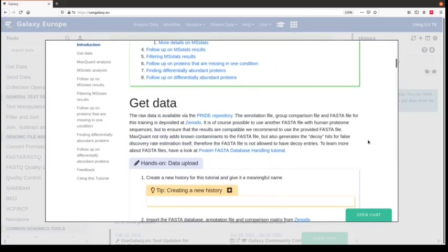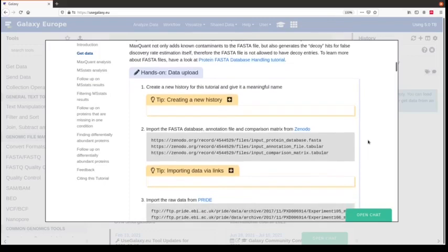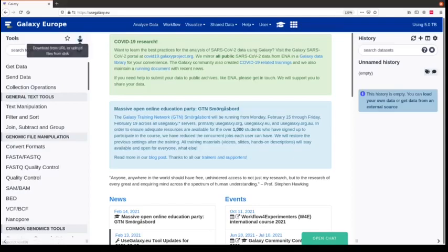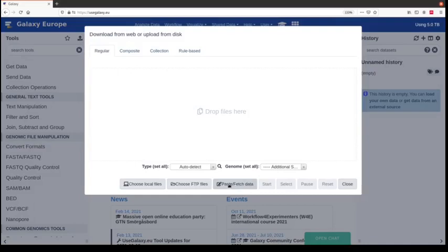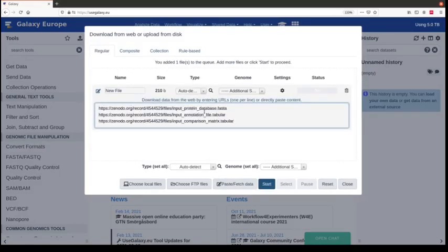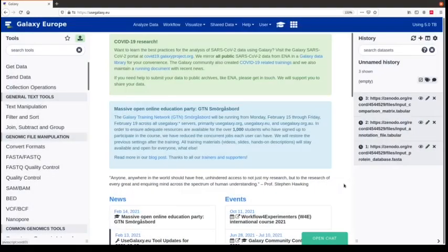We will start by uploading the data. Part of the data is deposited on Zenodo. We can copy everything and transfer it to the upload button, choose paste and fetch, and then paste the links to these three files. We press start and close. If you are not familiar with Galaxy yet, please look at the Galaxy beginners lectures and hands-on training.